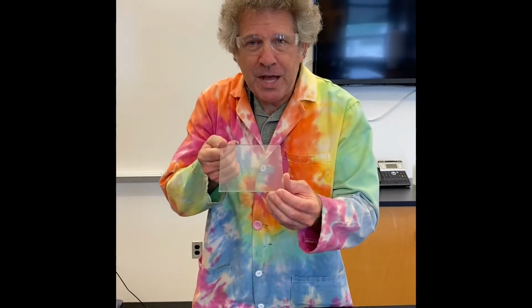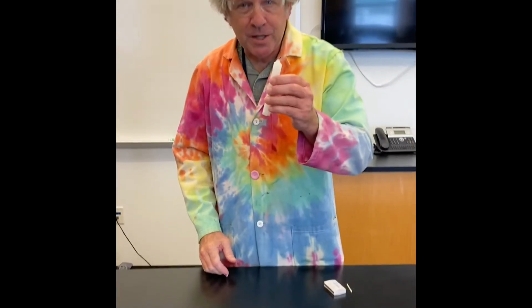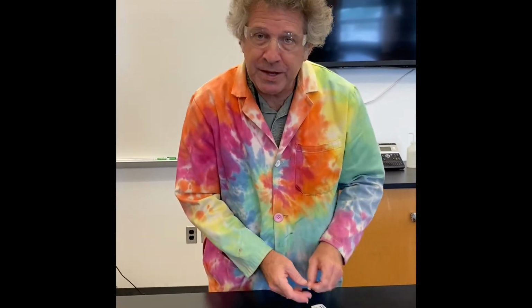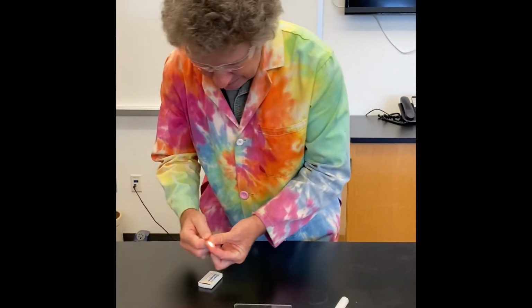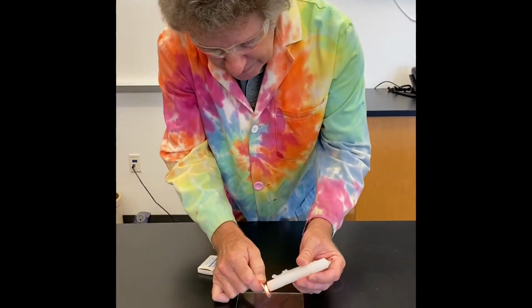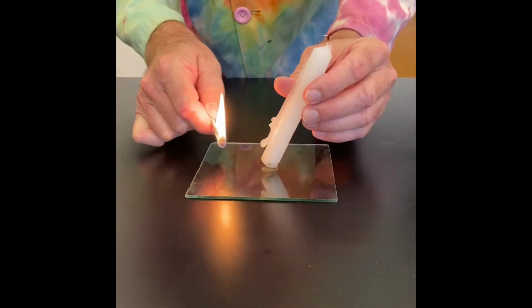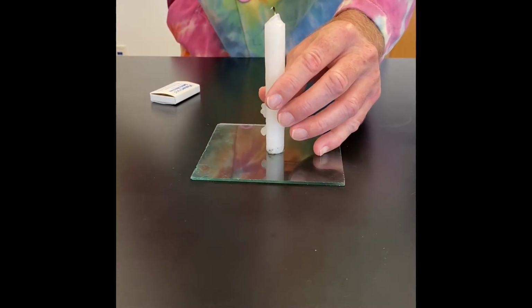I have a glass square that I'm going to set on the lab counter, and I'm going to take our candle and heat the bottom of the candle and secure it to the glass square. So I'll light a match and add some heat to the bottom of the candle. That'll soften up the wax a little bit, just like that, and secure it to the glass square.